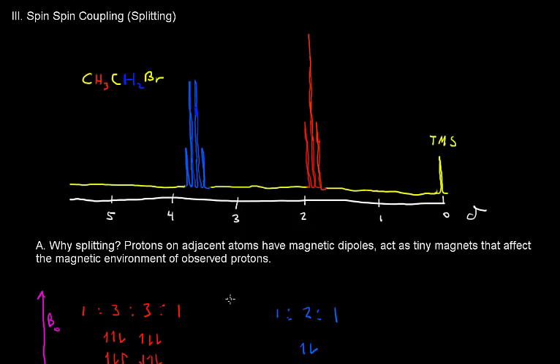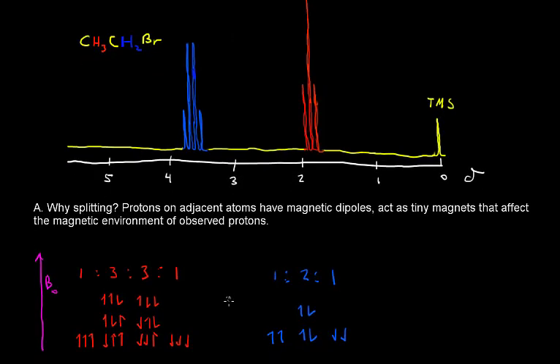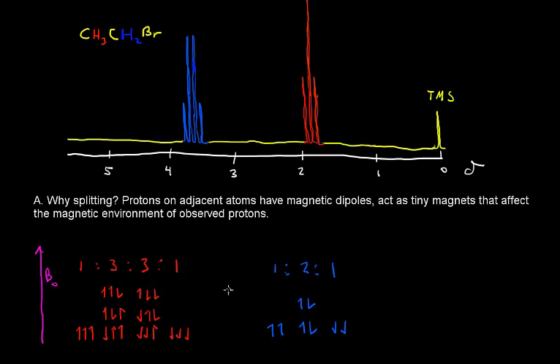So I have a splitting tree for both of these protons down below to show you what's physically happening here. I've color-coded this tree for these 3 protons. These three protons give us a triplet, but they split these 2 protons into what's known as a quartet. So 3 peaks like this is a triplet, and this is a quartet, 4 peaks, 4 resonances.